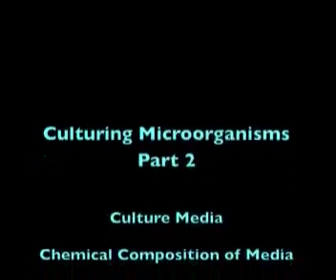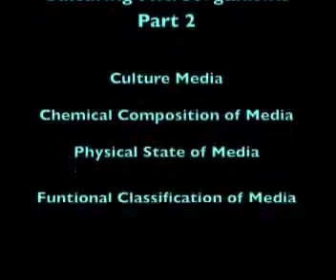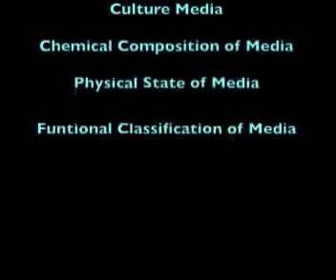In this video, we will continue to look at the requirements for the growth of microorganisms in the lab setting. We will examine culture media and its classifications based on chemical composition, physical state, and various functional classifications.